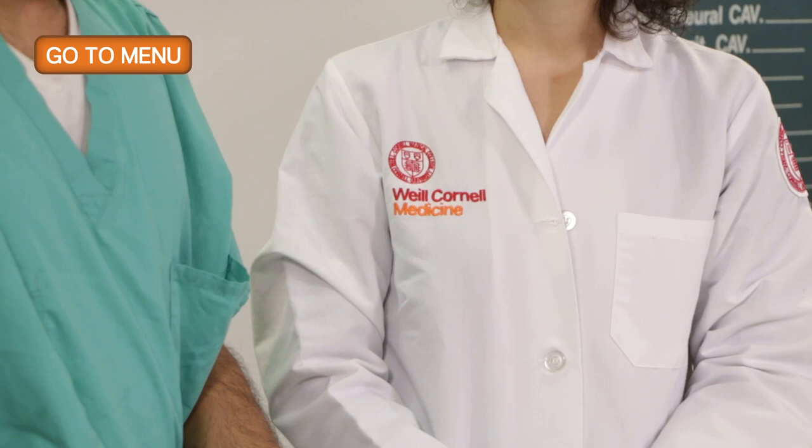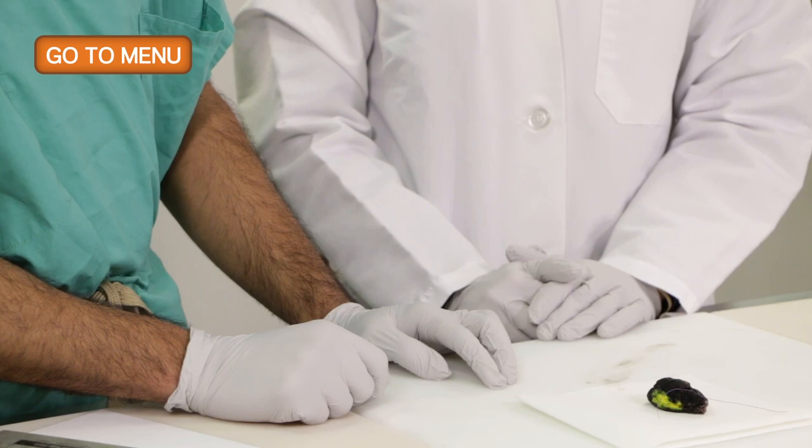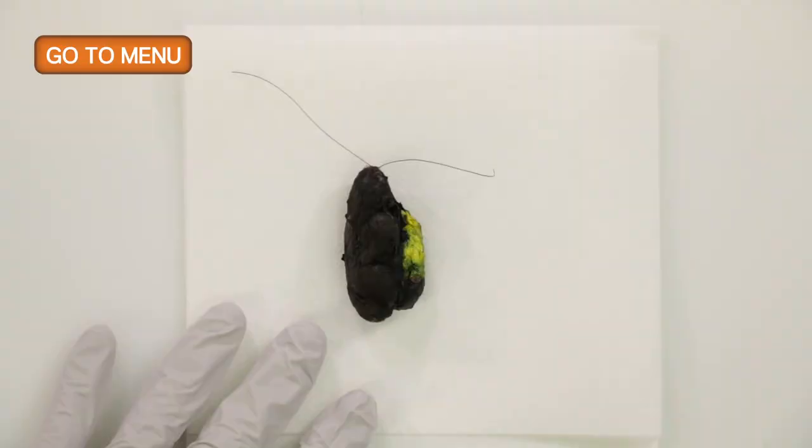Right. So size is going to be an important factor in determining how we go ahead and gross this specimen. Do you know anything about... Yeah, so when I looked at the history for this patient, the patient has a 2.3 centimeter lower pole nodule on the left thyroid. So there's a single solitary nodule in the left lower pole. Okay, so it's greater than 2 centimeters.